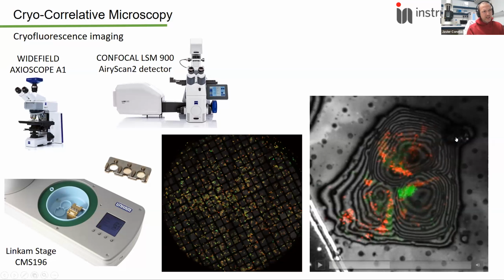And also in gray values, you have the reflected light that is also giving us information about the sample quality preservation. These concentric rings are telling us that the sample has volume, and that the absence of these rings in the area surrounding the cell is telling us that there is not much ice there.